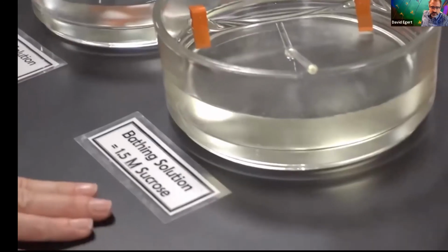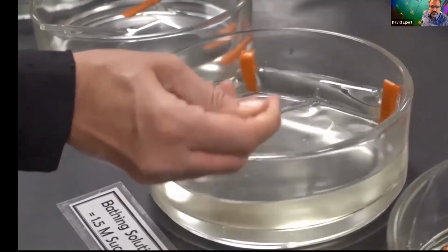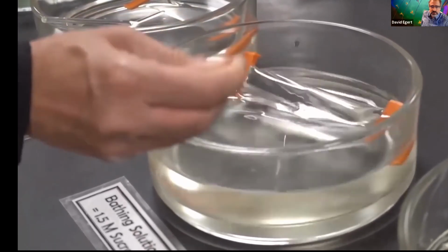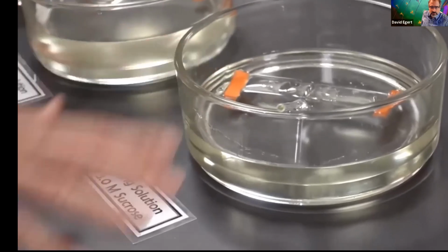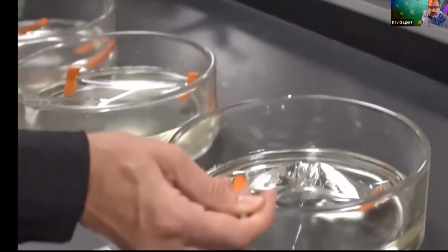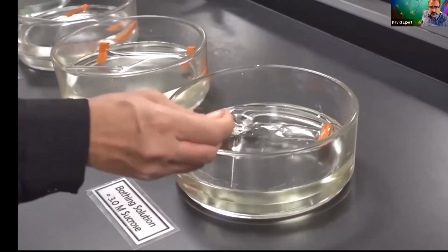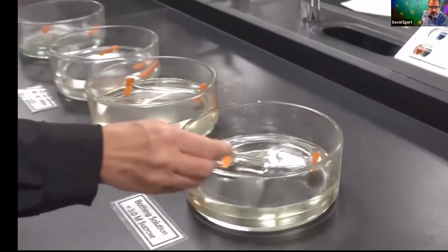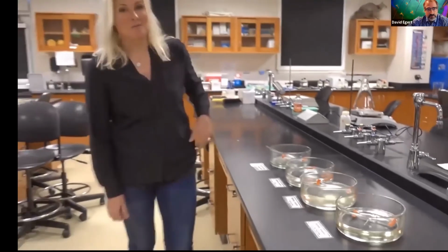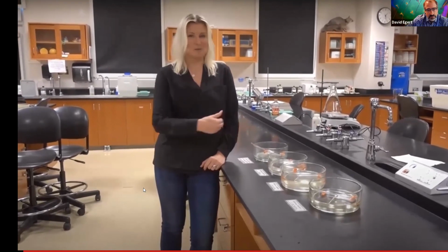This one has been in the same concentration as we put inside the tube, and so this one is very much like the control sausage, the same consistency. And then if we go to the one that's been put in a more concentrated solution, you can see that it's pretty soft and flaccid. So obviously this sausage has lost water to the outside solution. All right. Now it's up to you to figure out exactly what happened, which way did water move, and what do we call the solution that we put them into.